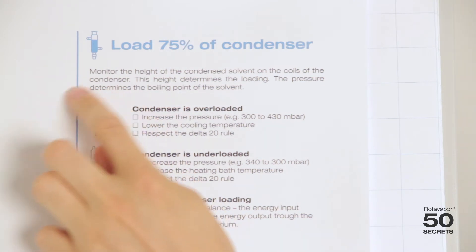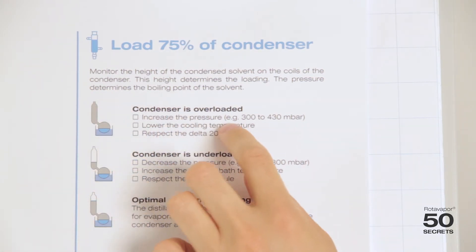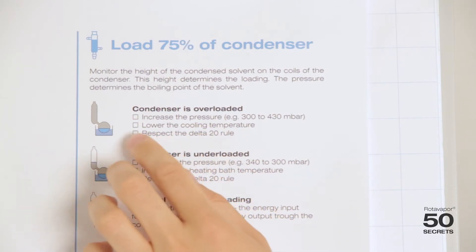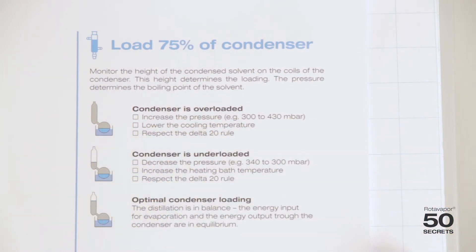If you have a condenser loaded like this, it is overloaded. So then you should increase the pressure, lower the cooling temperature, and always respect the Delta 20 rule.